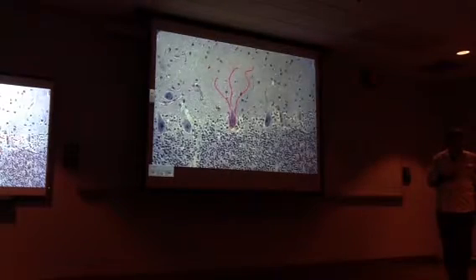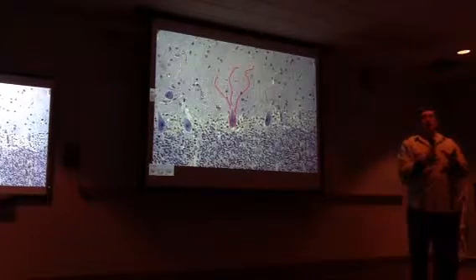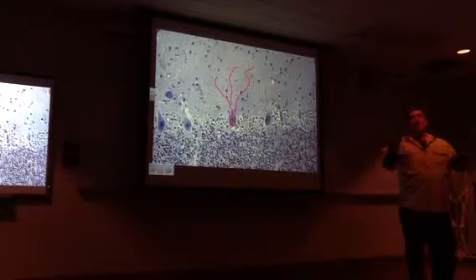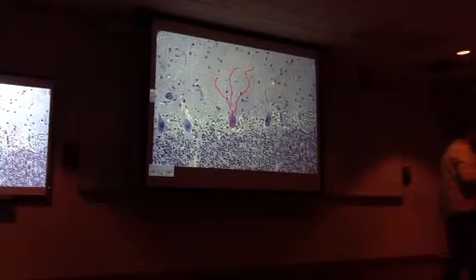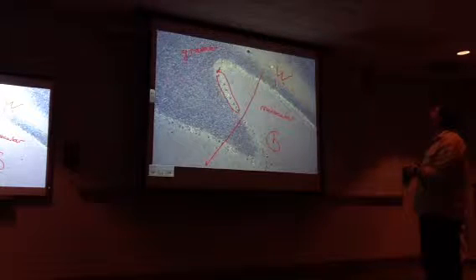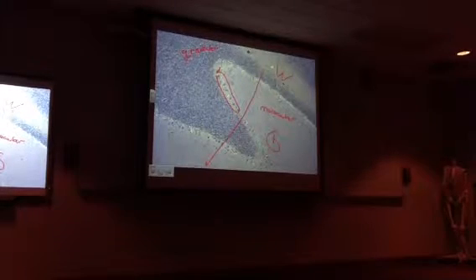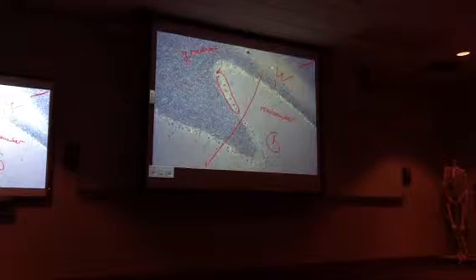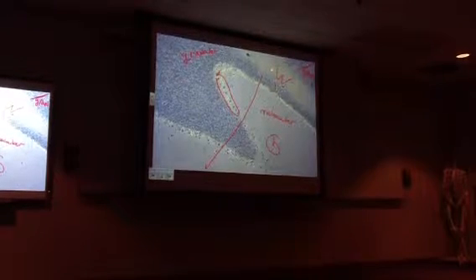It is confusing. And remember that in the spinal cord, the gray matter is deeper and the white matter is more peripheral. It's just the opposite in the brain. The very top right-hand corner, it changes back to gray matter, correct? Yeah, the very right, absolutely. And so right here is granular. I can't spell it all out, but that's granular.